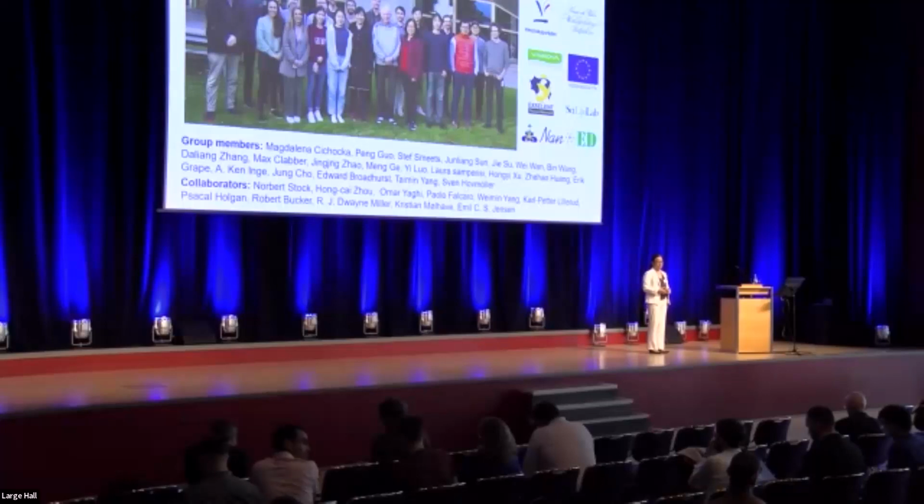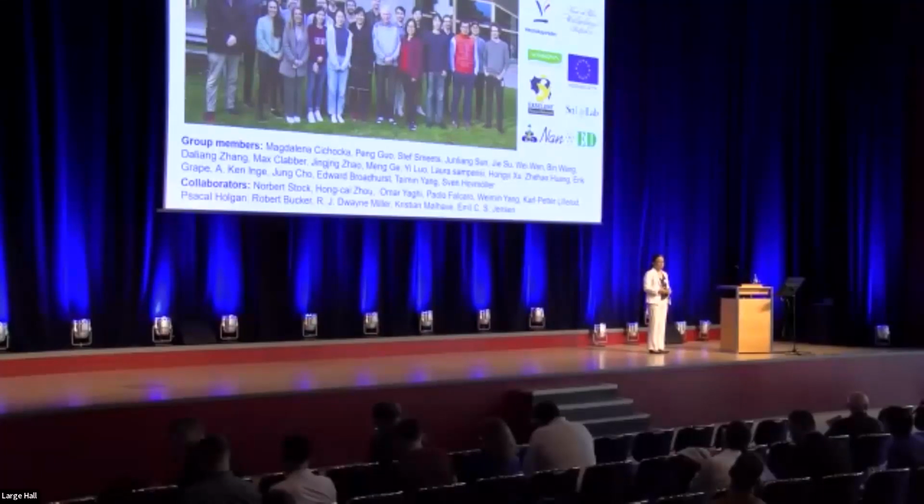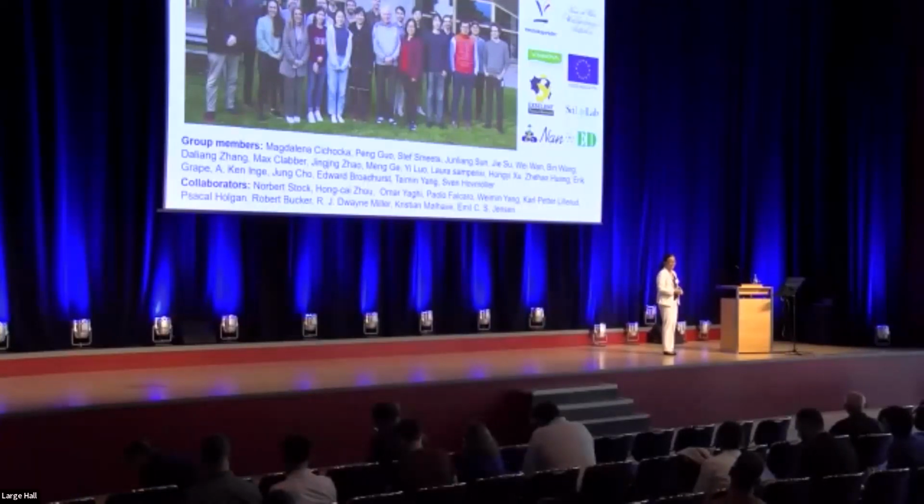I wonder if one day there is a possibility that we can determine the structure of some organic complex, like a protein, molecule, or some virus, or even maybe combining with cryo-electron microscopy. I think that will be. Yeah, we have done that. I haven't shown that. We have studied a lot of pharmaceuticals and also protein crystals. Then that's really advanced. Thanks.